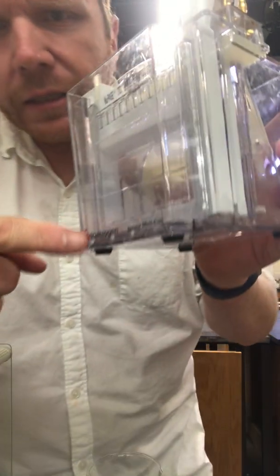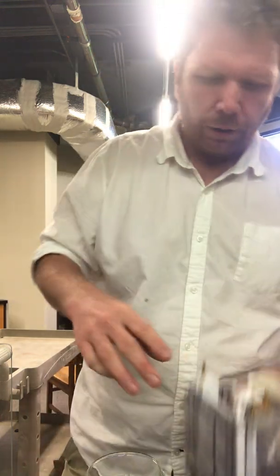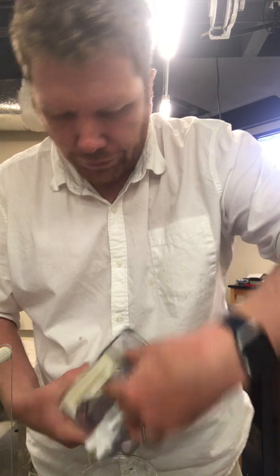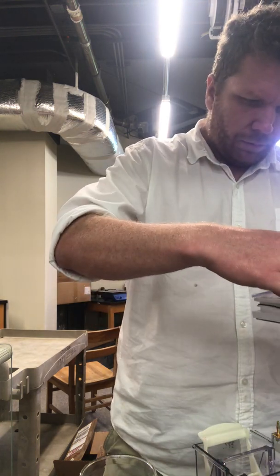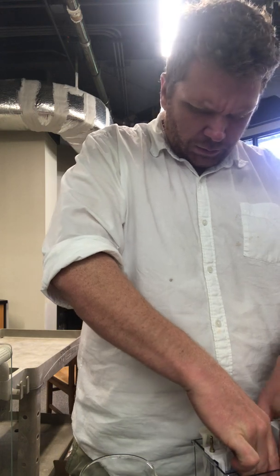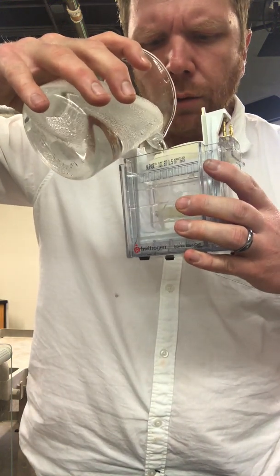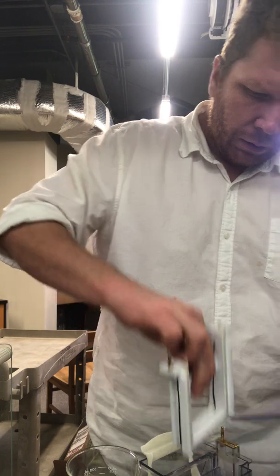One thing that I'd like you to notice is there isn't very much of the solution. Oh, no, I do have a lot of the solution spilling out. What that means is I need to try to make a better seal. So I'll pour this all back in. Okay, now let's try that again, Joel. So I've got my gasket. Push this down, make sure that it's all wrapped up there. Now I'm going to try transferring my running buffer to that central chamber. It's spilling out again. Okay, so take this up again.